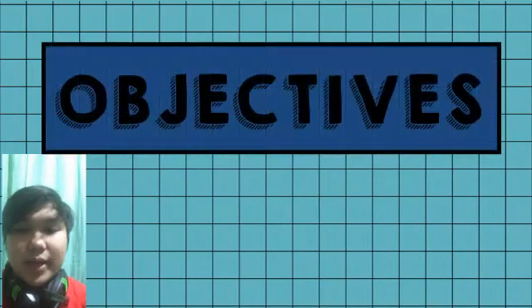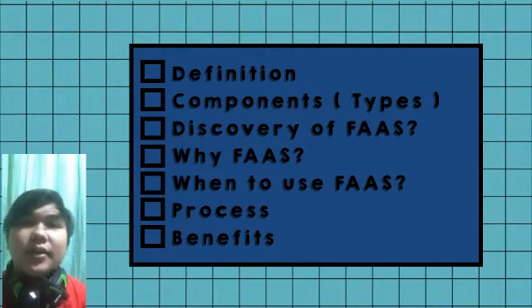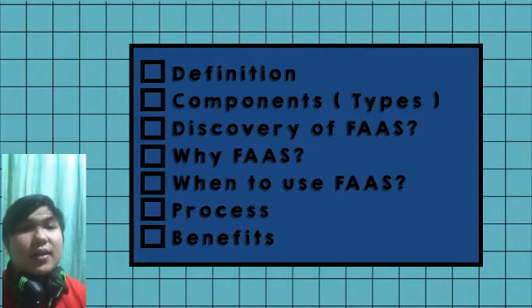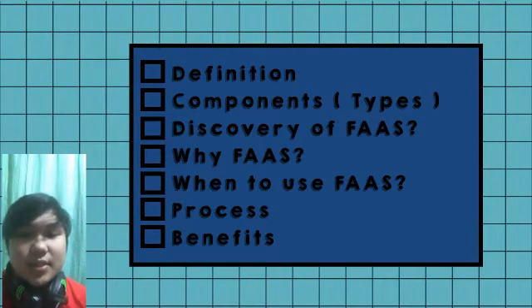These will be the objectives for today's lessons and presentation. We will learn the definition, components, and discovery of FAAS, why and when to use FAAS, the importance of using this technique, the process, and the benefits.